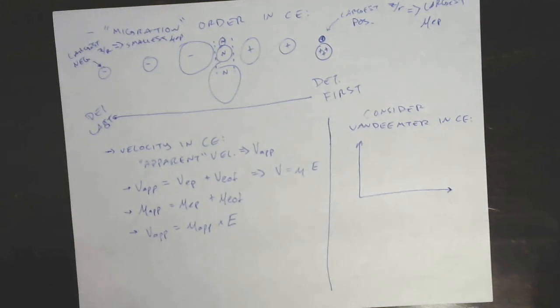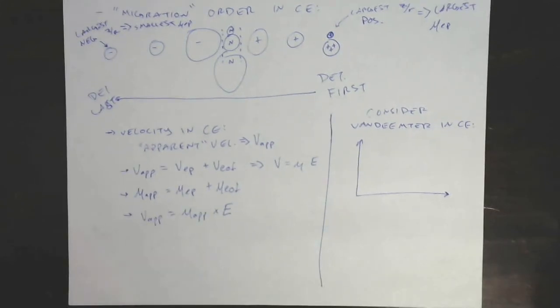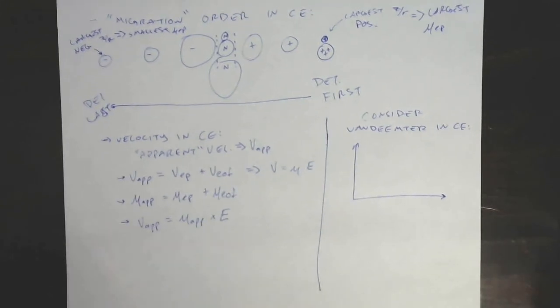are the A term, eddy diffusion, right? That's different flow paths around a packed bed. The B term, longitudinal diffusion, that's just the band broadening that happens over time as a plug diffuses longitudinally on the capillary. And resistance to mass transfer, this is related to the amount of time it takes for things to partition from one phase to the other, right?